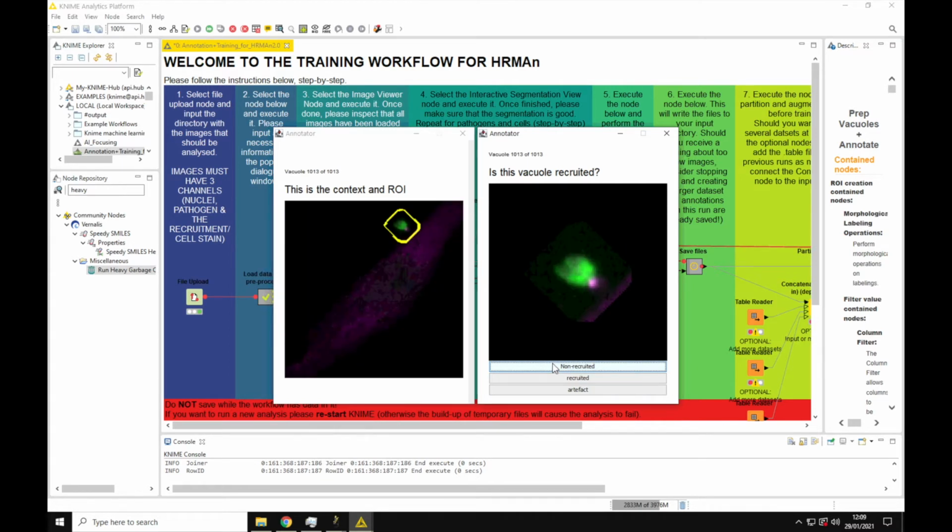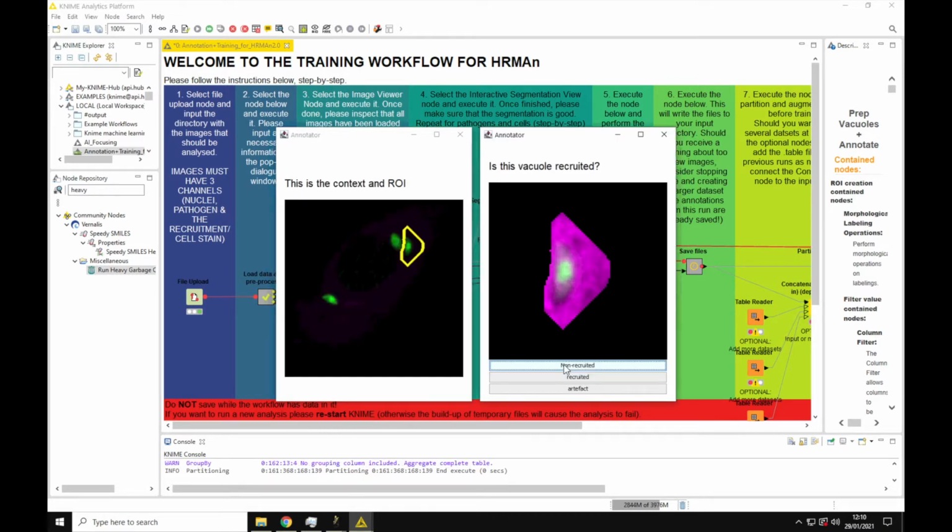So now you can see we're nearly done here. I've arrived at the last image, and if you've watched closely, you could see I also had a few images in there that I mixed in on purpose that I knew would create artifacts. So this class is also represented. Now once I click here on the last image, it's just going to randomly pick a few more to assess how good my annotation is. So I'm just going to go through these real quick.